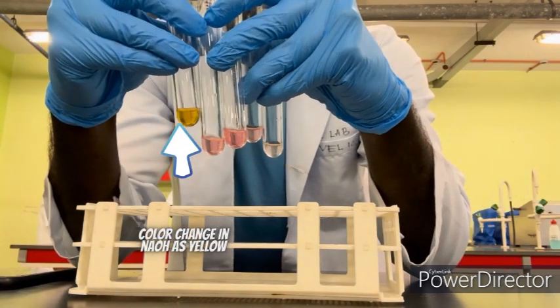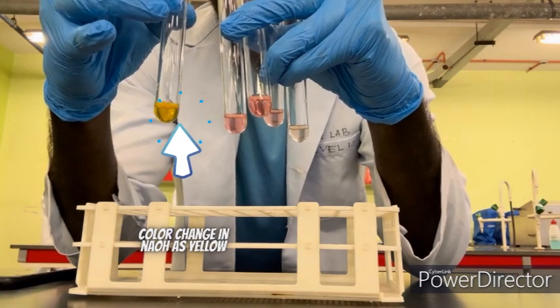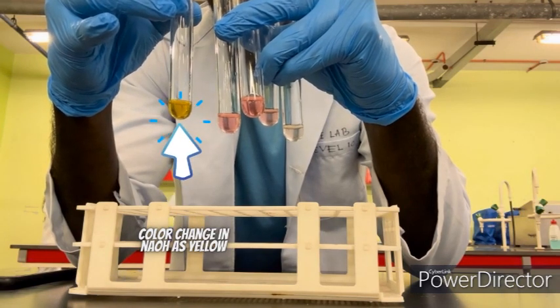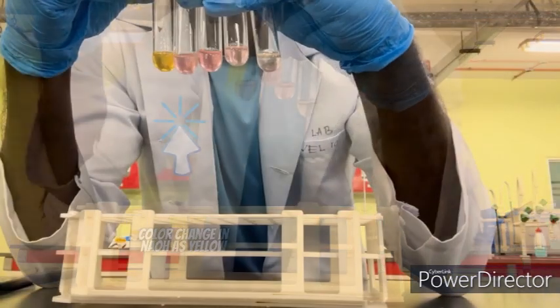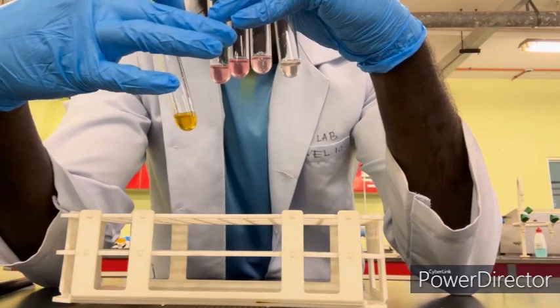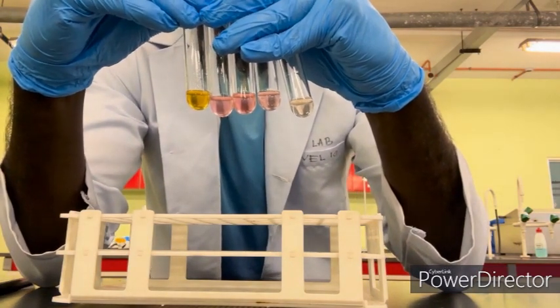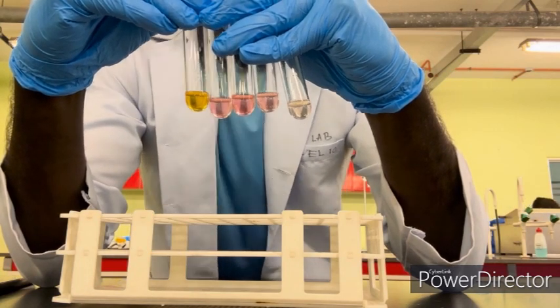And the last one will be the NaOH, 1M. Okay, so we can see there is a massive color change for this part. Once we added our onion peel extraction to our solution, this one will be yellow. So we can see for these three chemicals, once we added our onion peel extraction, from here we can know that the higher the concentration, the greater the color change.